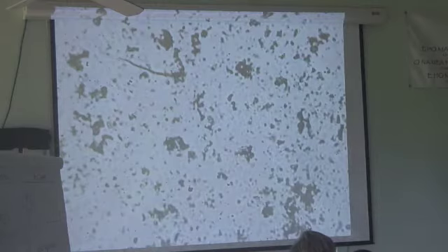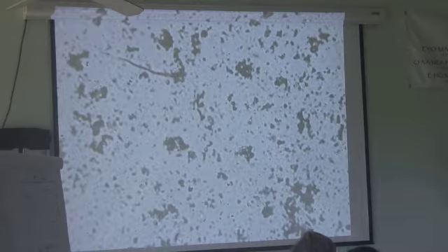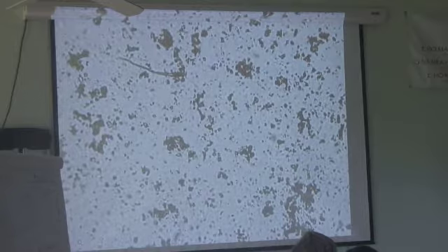Now I've maximized my ability to resolve everything in this picture, and you'll notice that it's easier for everything to be really sharp and crisp. So now, the condenser is focused, my eyeballs are focused. Now I'm ready to go up to my highest magnification.